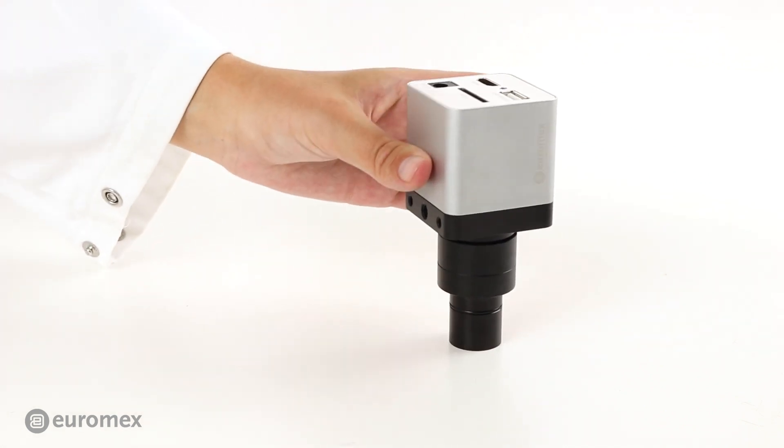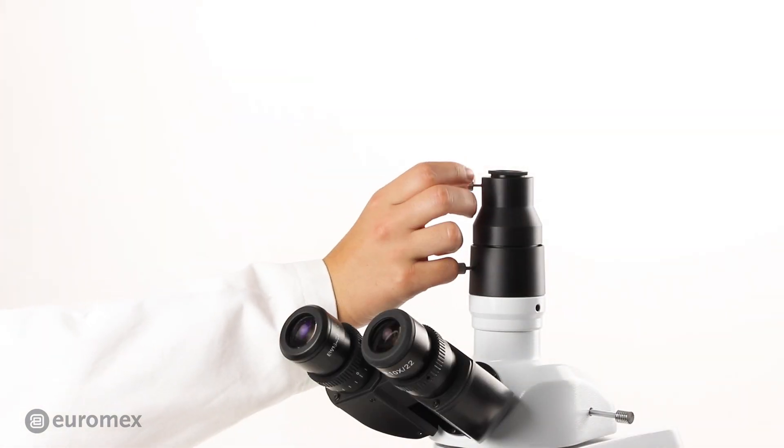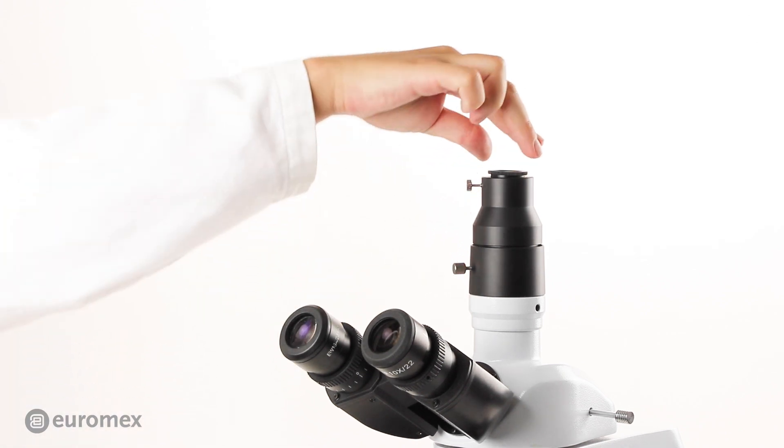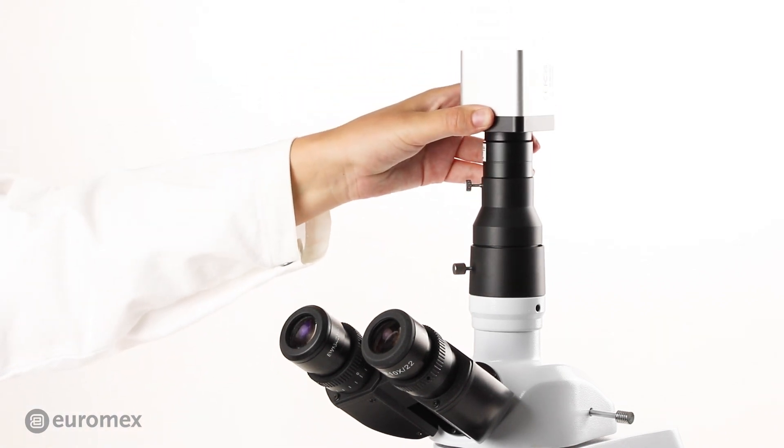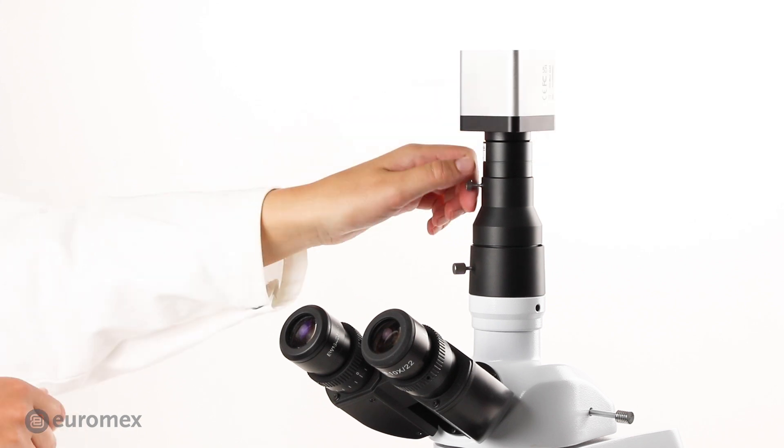How to proceed with an adjustable trinocular tube: Put the camera with C-mount adapter in the adjustable trinocular tube and fixate with the screw.